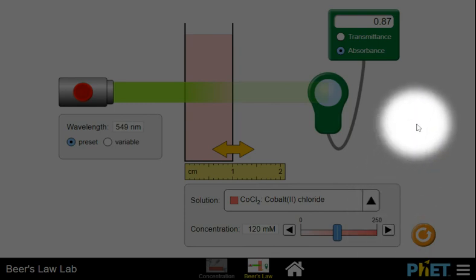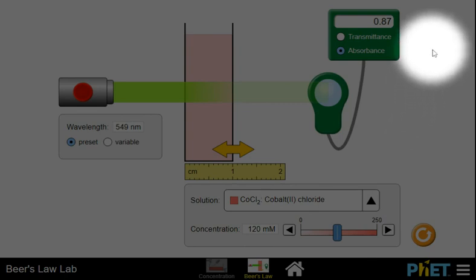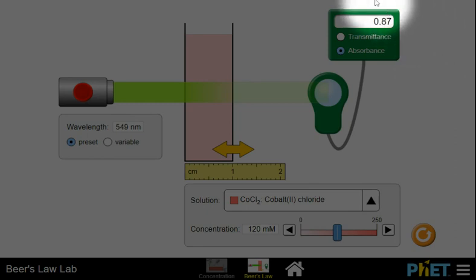Okay, that's kind of the blood and guts. You need to go to the handout now, which has all of this laid out in a static version, and then get you collecting some data so that you can kind of use this simulation as a mock laboratory for deriving some information about Beer's Law. Good luck.